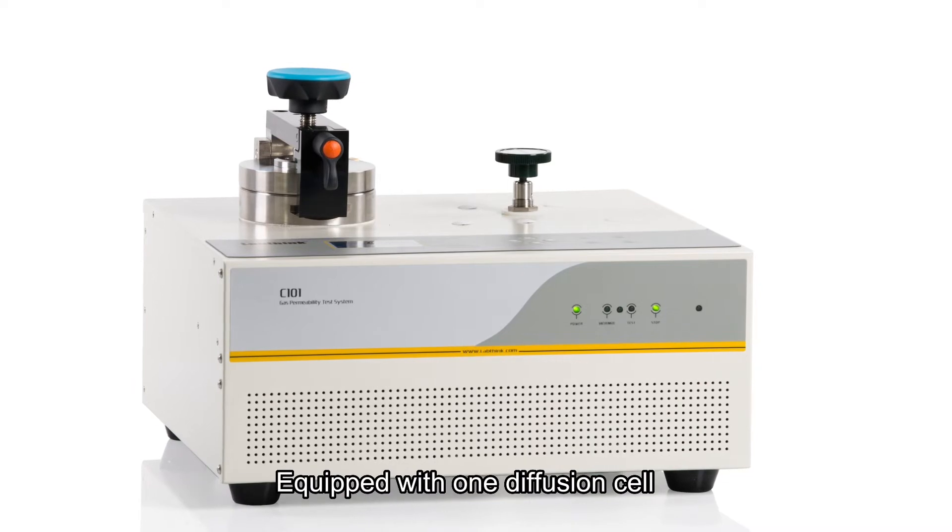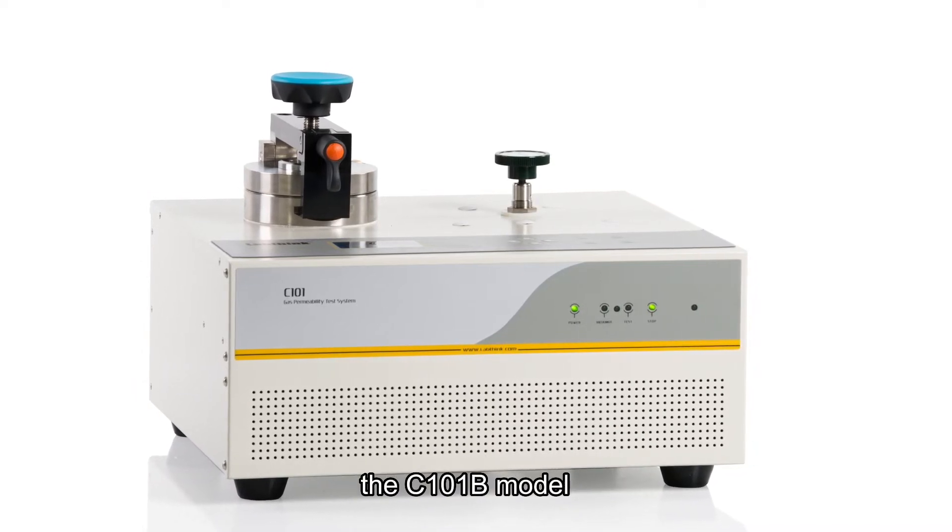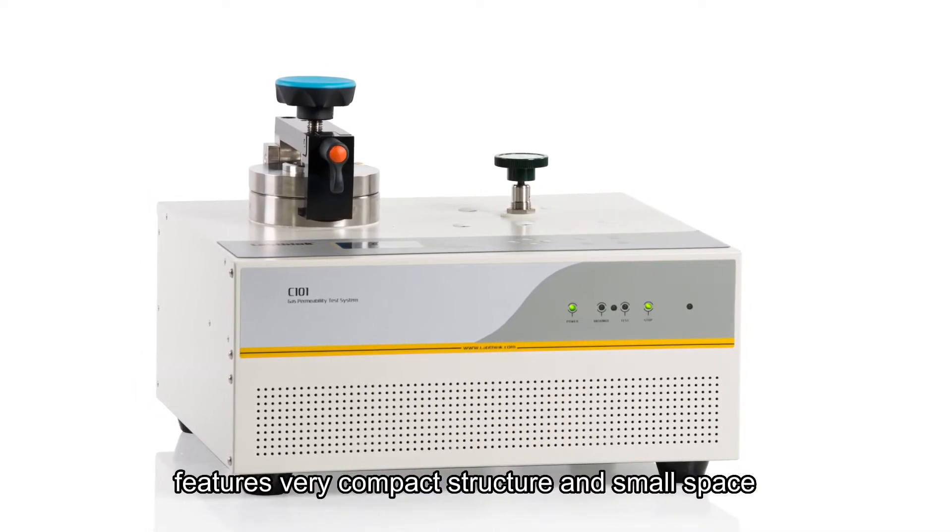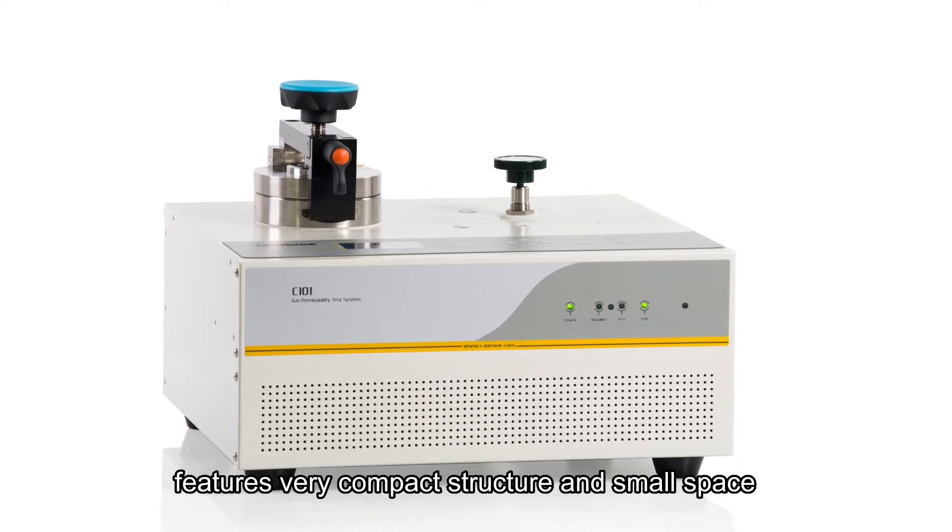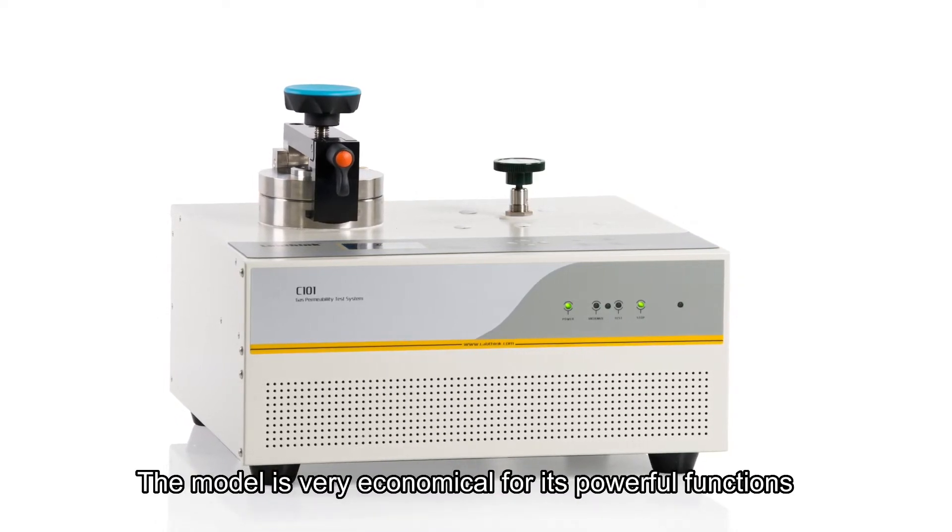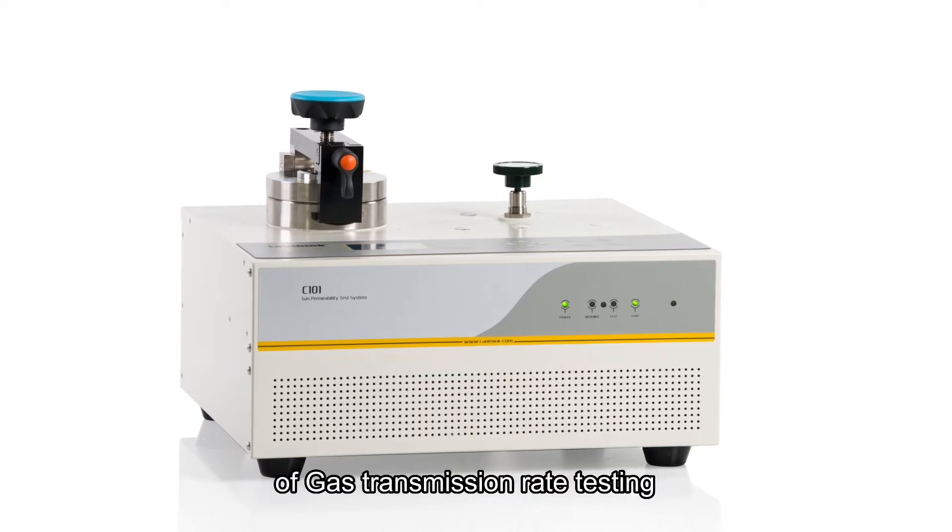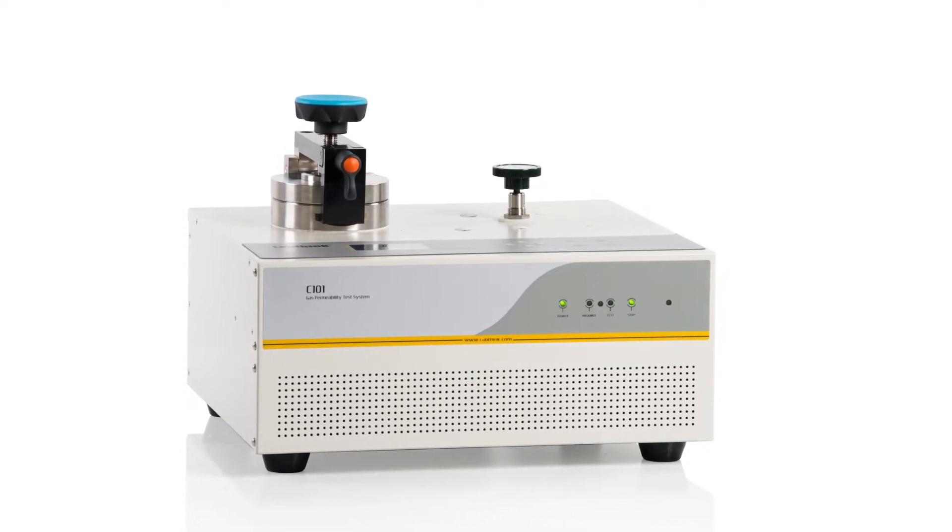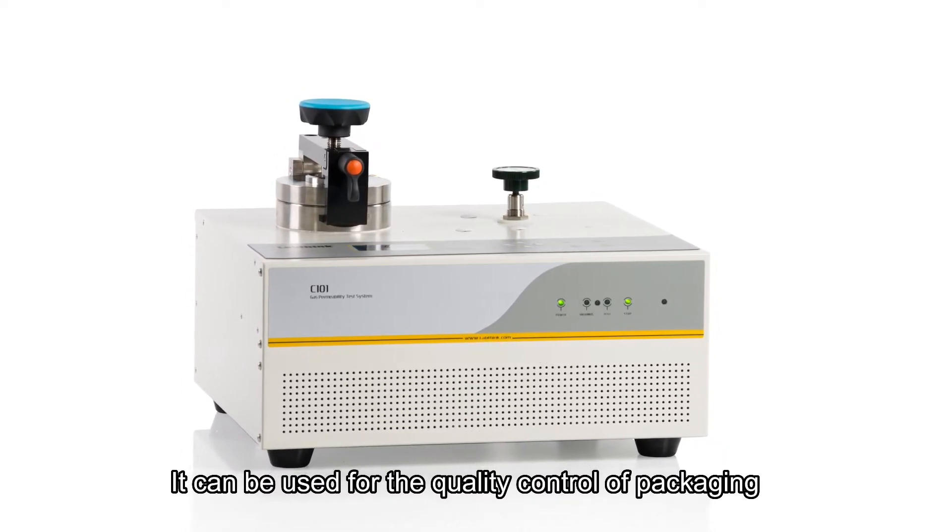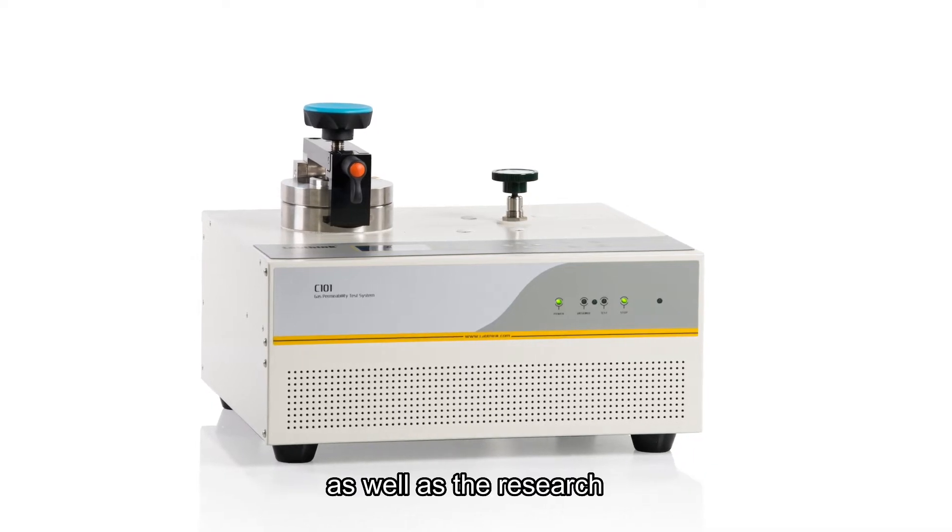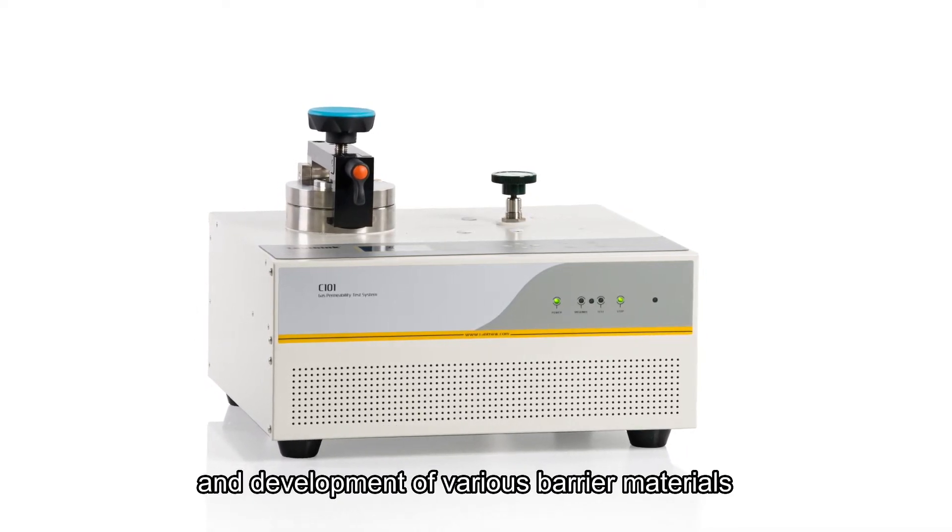Equipped with one diffusion cell, the C101B model features very compact structure and small space. The model is very economical for its powerful functions of gas transmission rate testing. It can be used for the quality control of packaging, as well as the research and development of various barrier materials.